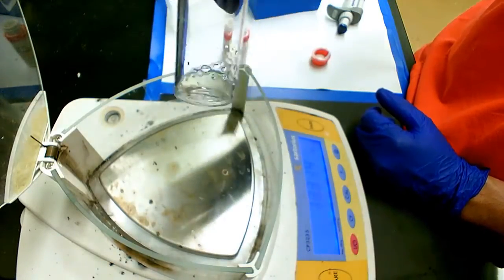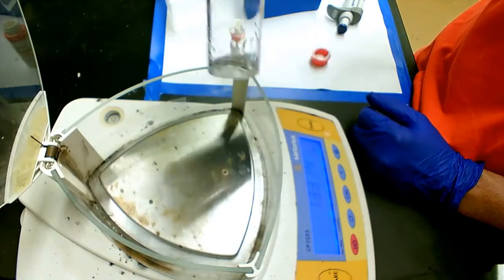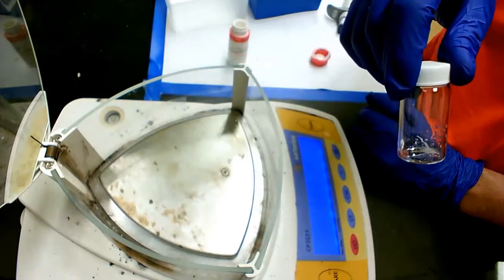Next I will show you how to make a drop cast film using a solution I already prepared a long time ago, which is super uniform and will give you a good sample. So now I'm going to show you how to prepare a dye-doped PEO solution, which we will use later to drop cast a polymer thin film.